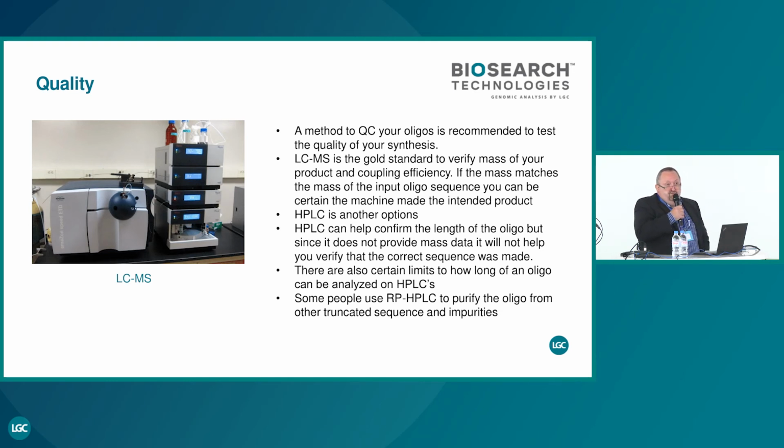And afterwards you have, of course, the HPLC. You can use the RP HPLC or the ion exchange HPLC. You can do both also. Some people do both HPLCs to target very high purity. But don't forget, the more you clean, the less you have. This is also very important. And for the very long oligo, there is still the PAGE, the polyacrylamide gel electrophoresis. But this is more for development. You don't do that for large scale, of course.